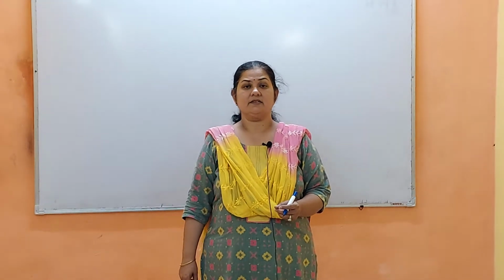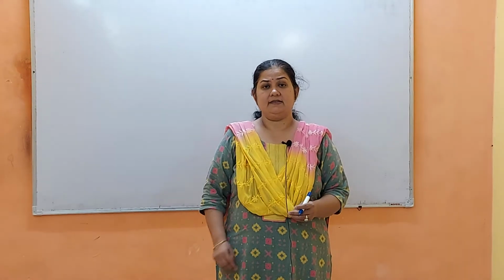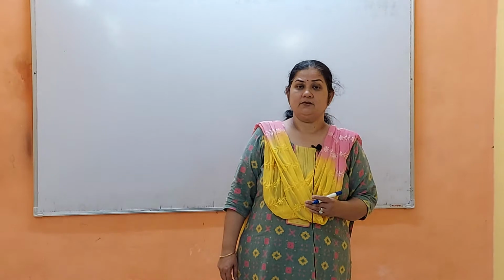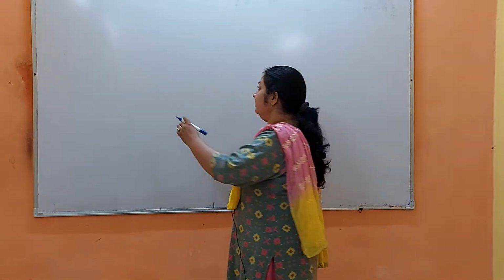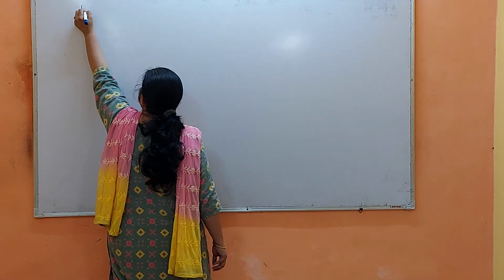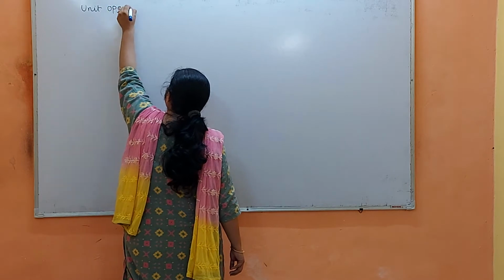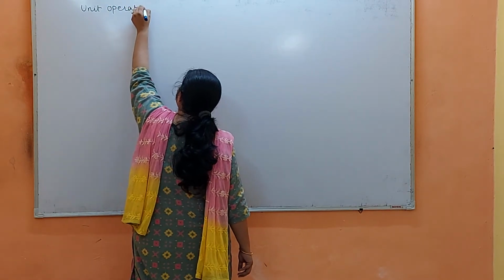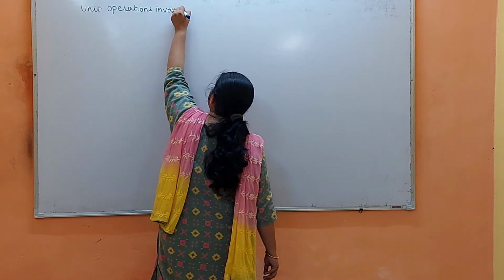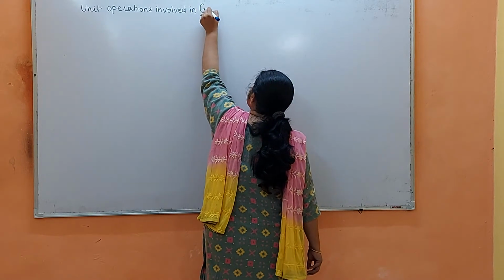In my last lecture, we have seen the types of gravimetric analysis and the factors affecting the solubility. Today we are going to see the various operations involved in gravimetric analysis, or unit operations involved in gravimetric analysis.